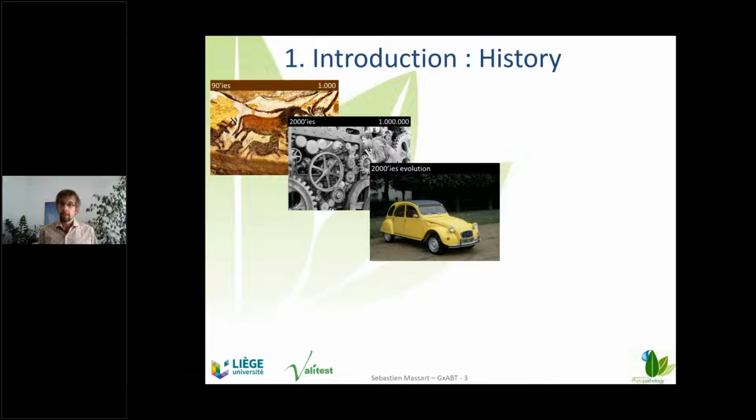During the first phase of the year 2000, the evolution was like this old car. It was evolving quite significantly, but this was not yet the booming of high-throughput sequencing. The real thing is that the evolution of the throughput and the cost followed the one of the computer.